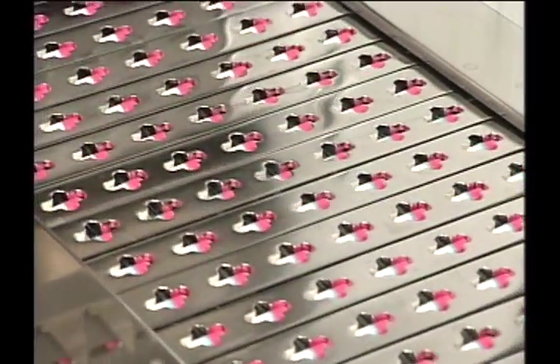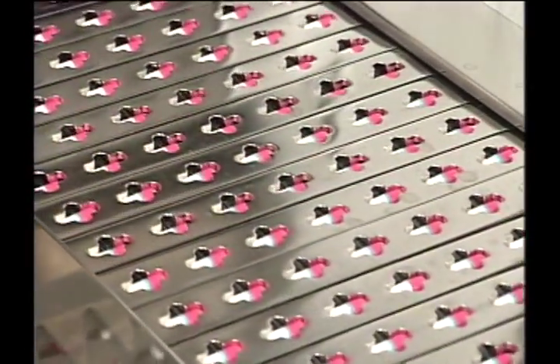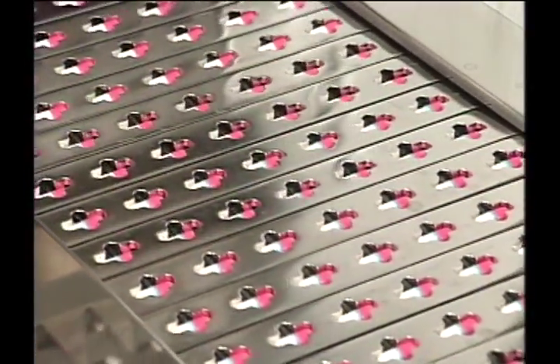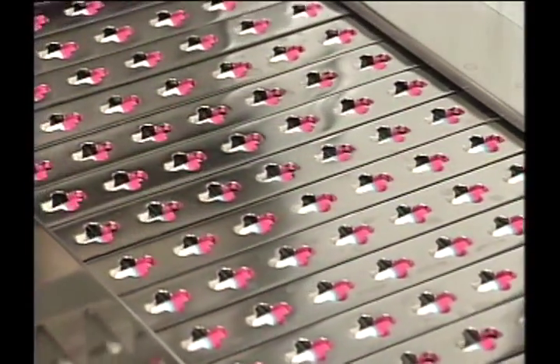This automatically determines the position for sealing by a function that controls the capsule's position and fixes the length from the capsule's tip after orientation. This can be used even in cases where the lengths of the capsule's cap and body are different.